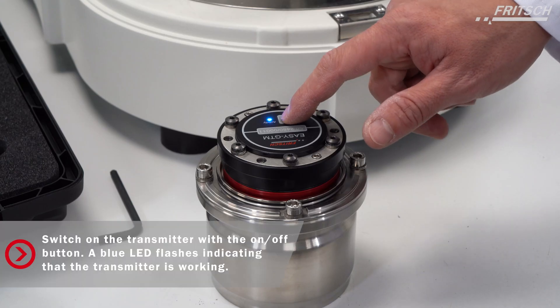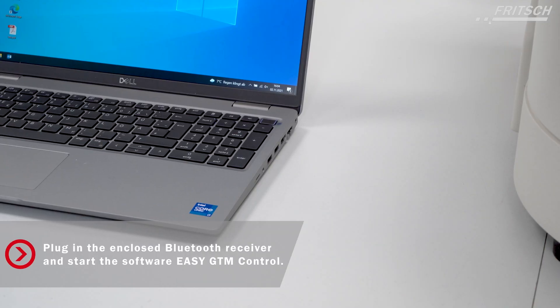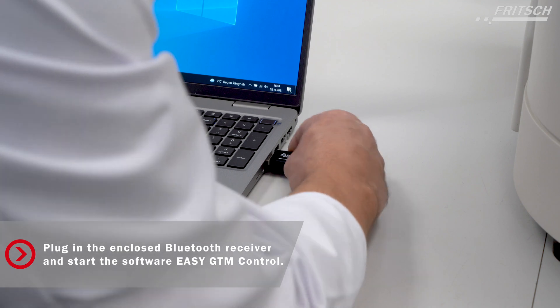Now we have to switch on the EZ-GTM system. We have to connect the computer with the EZ-GTM system.